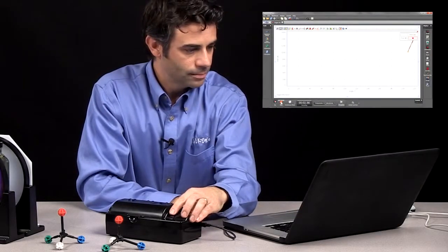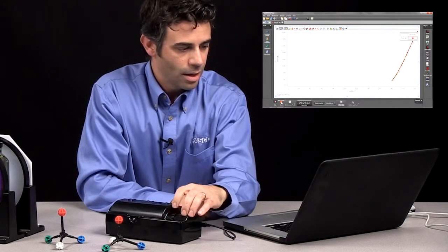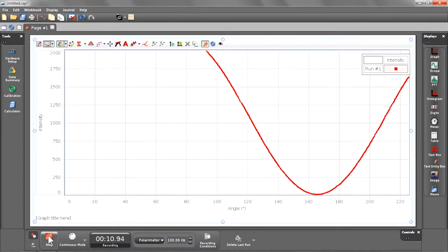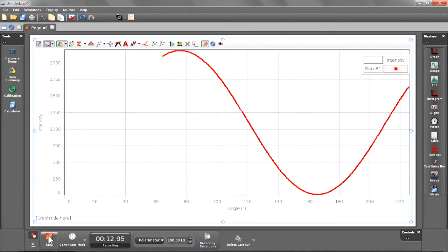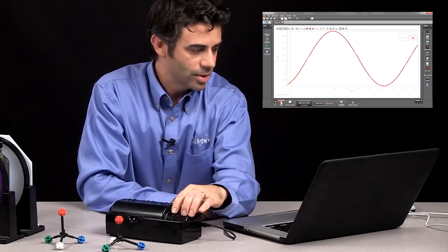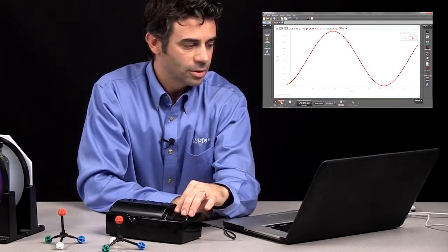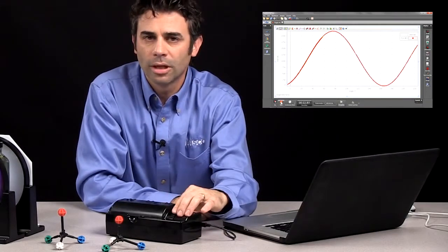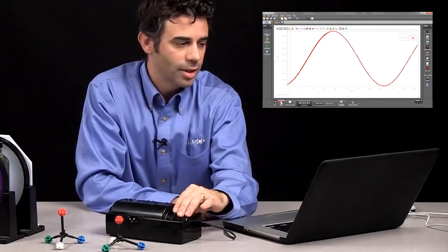And I'm going to start spinning the wheel. And you'll see that there's my plot of intensity versus angle of rotation. There we go, a nice plot. And what I'm going to do is I'm going to go from 0 to 360 degrees a couple of times, just rotating around.